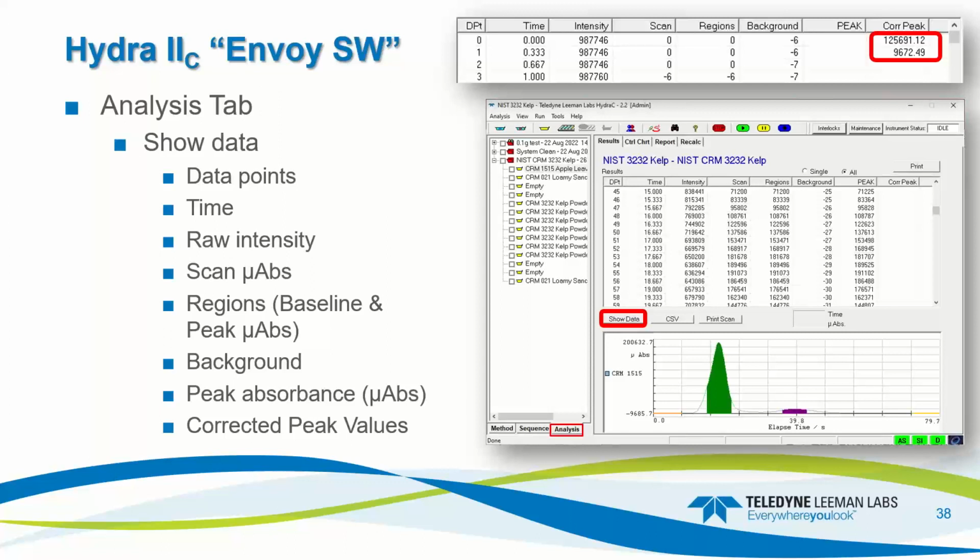So I mentioned earlier that the software integrates and reports against the best calibration range. So this shows you the value for each of those ranges. So at the top, in the low sensitivity region, you're at 125,000. So that would be in the low calibration curve. That's where it would report. I believe it flips over to the high range of a little below 400,000, about 380,000.